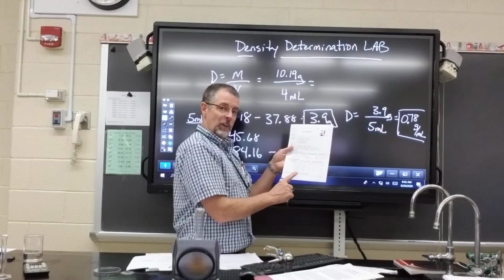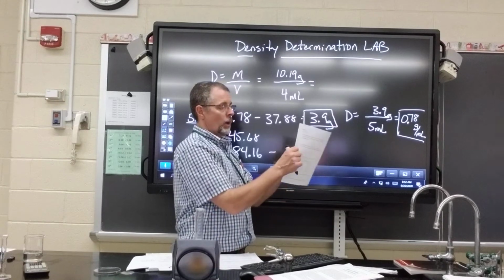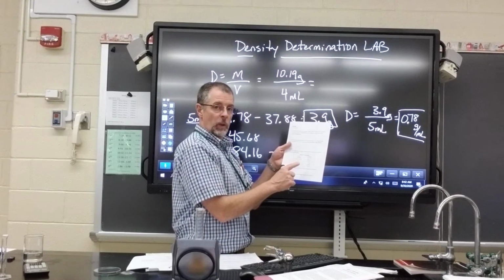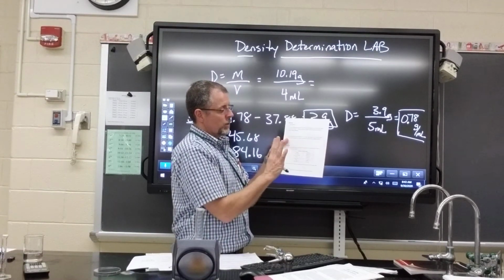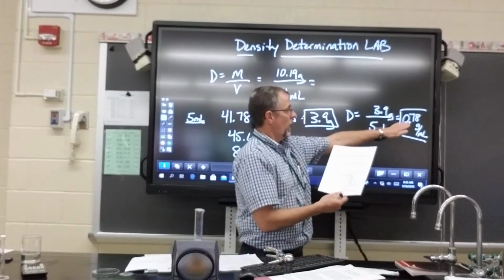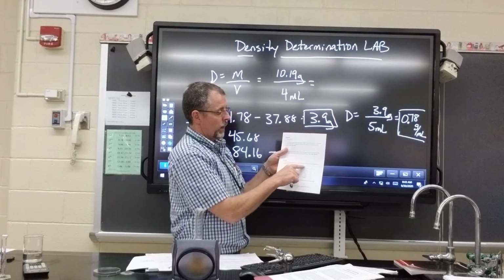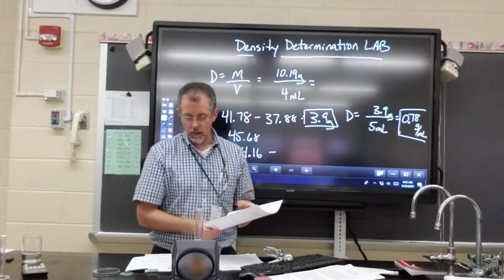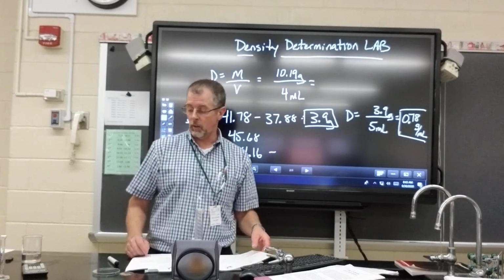Once I have my average density, and I'm going to write it out to 4 decimal places, then I'm going to go to the back and I'm going to match it against this chart, and I'm going to see which liquid it is. So by using the density, I can actually figure out which one of these liquids it is. Okay, so these densities back here are to 4 decimal places, so that's why I'm telling you, try and go to 4 decimal places on these. So once you identify your liquid, you'll write it up here and then calculate these other questions. Okay, so take some time to do this. Use these numbers. So you got all your measurements now. All you need to do is make all your calculations.